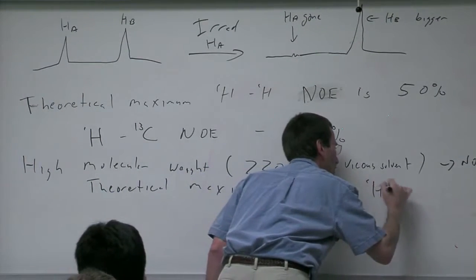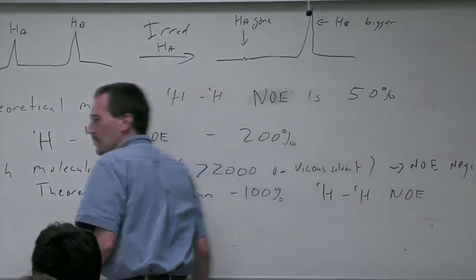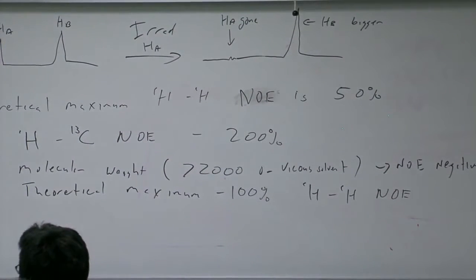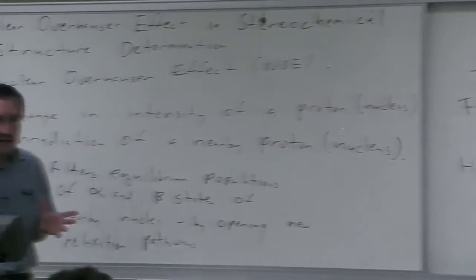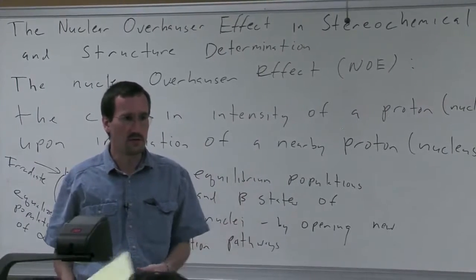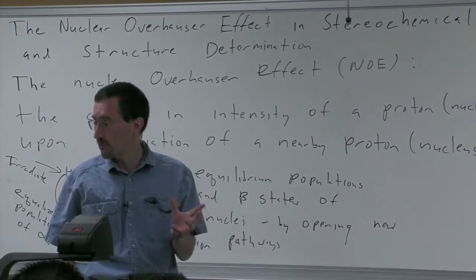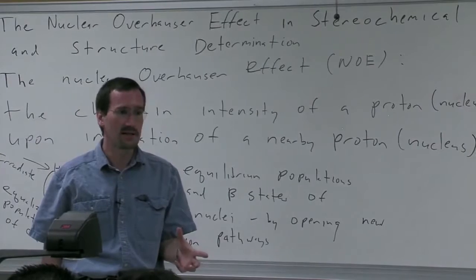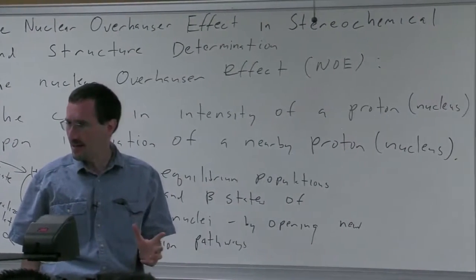For an HH-NOE. And this is important, say, in protein structure determination, rather than in small molecule chemistry, which is where we focus. Now these days, if you look at some of the natural products that are getting published in, say, Journal of Organic Chemistry or Journal of Natural Products or in JACS, some of these are pretty hairy molecules. In other words, they are small molecules, but they are big small molecules. And that big small molecule regime is actually a pain in the neck.